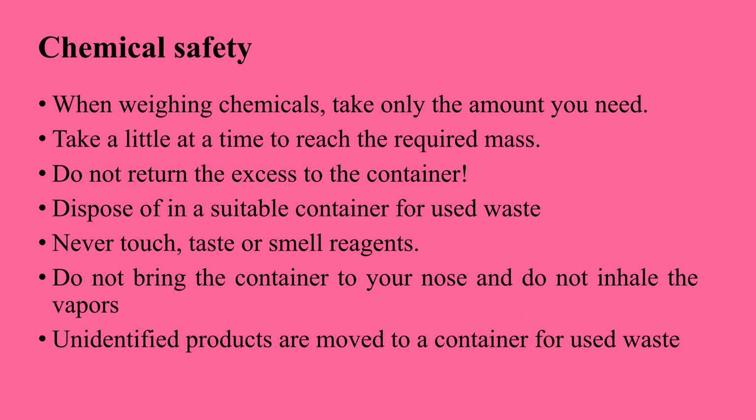Then there are rules for working with balances. Calibrate the amounts of chemicals. The main recommendation is to take the minimum of these chemicals.